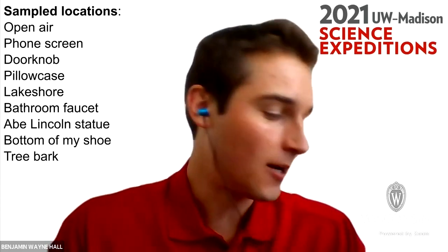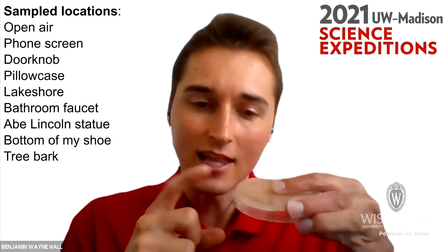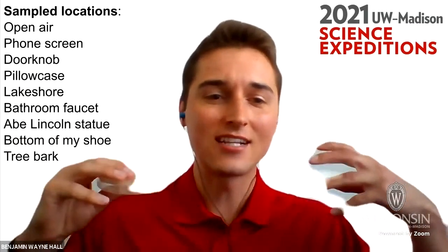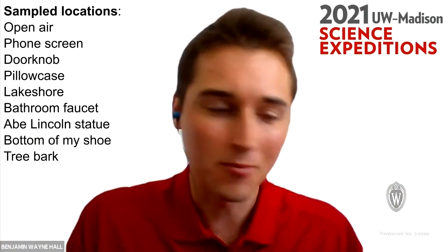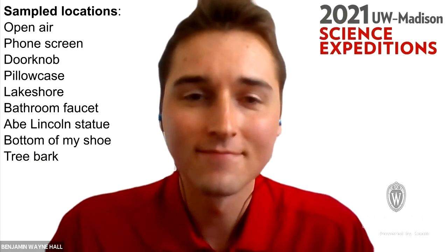So doing this experiment, we're only going to see the bacteria that like to eat this food. So if we really want to see all of the bacteria, we have to go out there and basically offer them a feast of all of the different foods, and we can see which bacteria grow on which type of food. All right, we've got some more comments coming in.